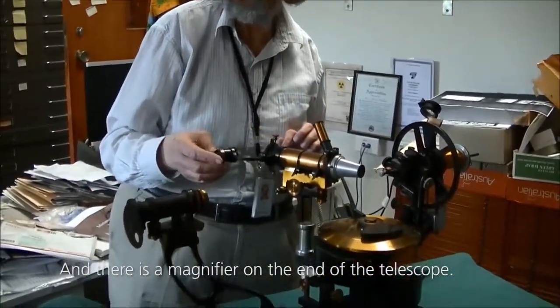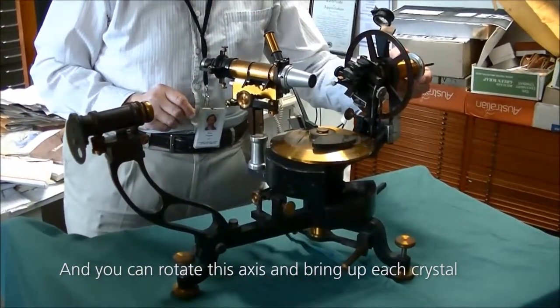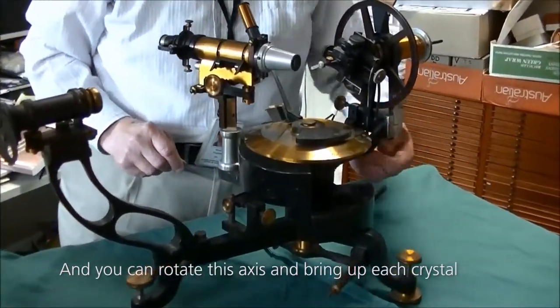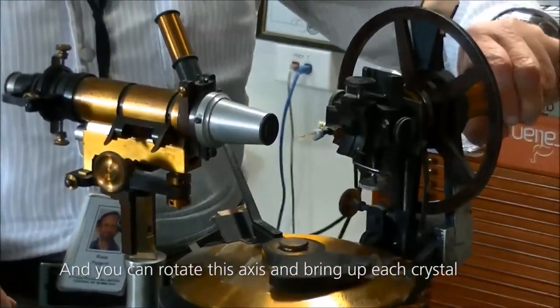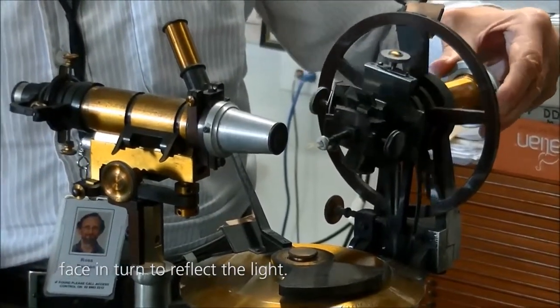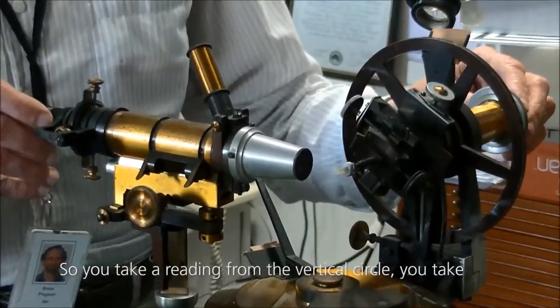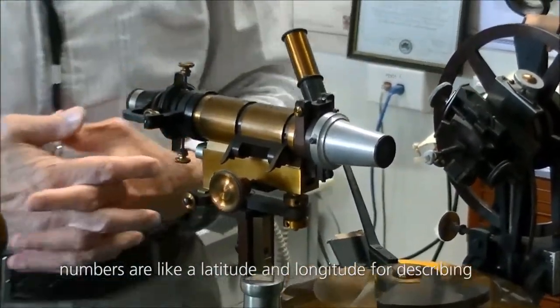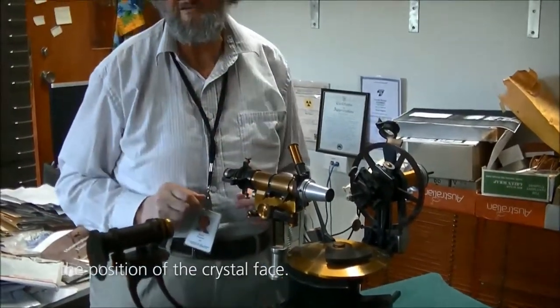There is a magnifier on the end of the telescope. You can rotate this axis and bring up each crystal face in turn to reflect the light. You then take a reading from the vertical circle and a reading from the horizontal circle, and the two numbers are like a latitude and longitude for describing the position of the crystal face.